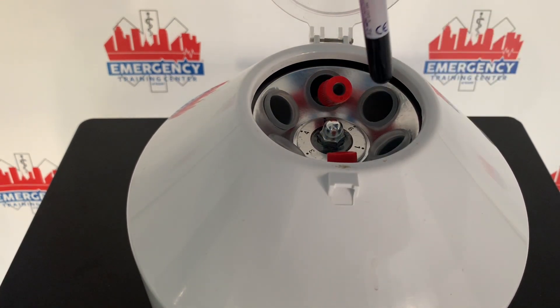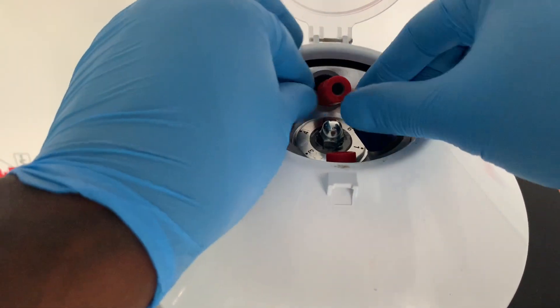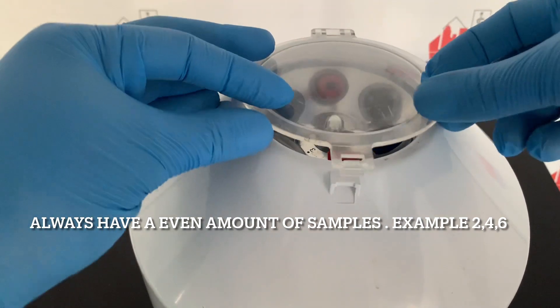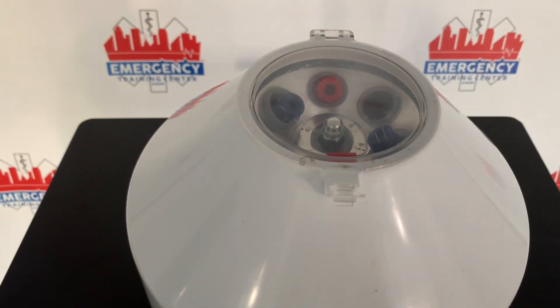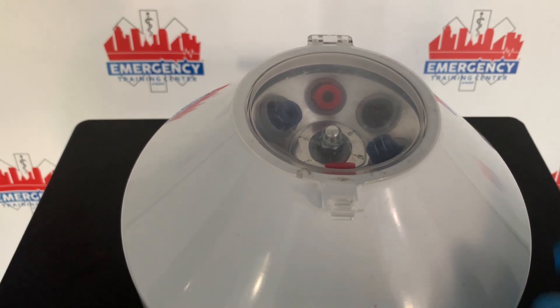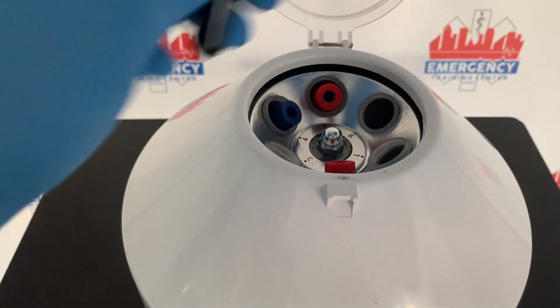You want to make sure that you have an even number of specimens — you cannot have an odd number, it has to be an even number. Then you turn the machine on and start spinning.